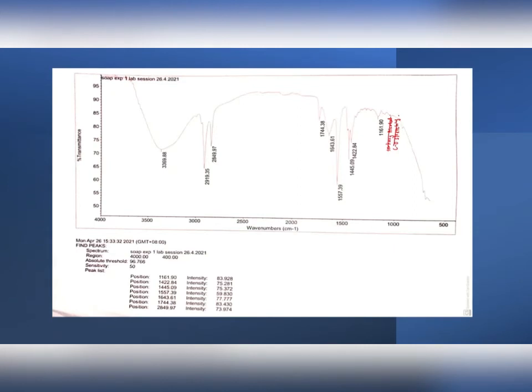These are the results obtained from the FTIR process. This region is known as the IR absorption range, which we can divide into a few regions: bonds to H, triple bonds, double bonds, and single bonds. The single bonds region is known as the fingerprint region. The fingerprint region is located at near 1500 wavenumber and below.